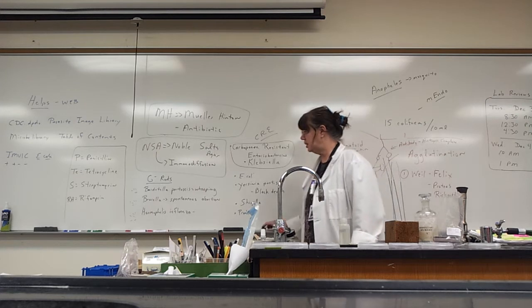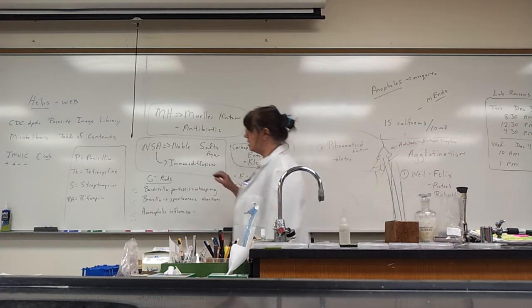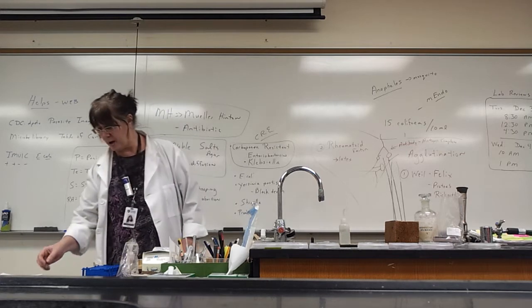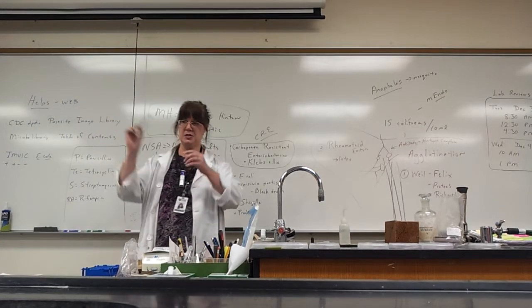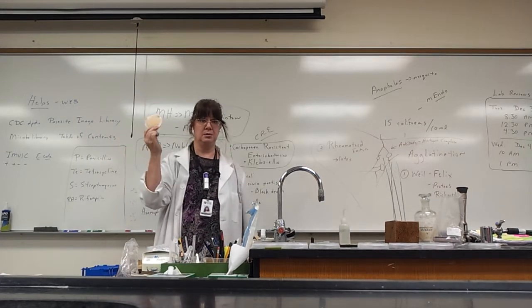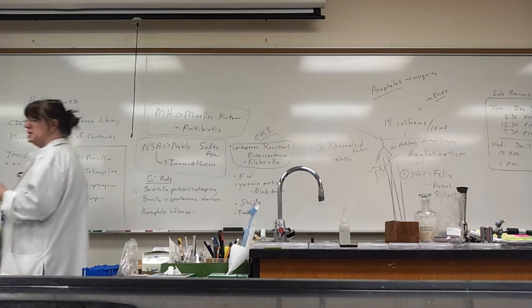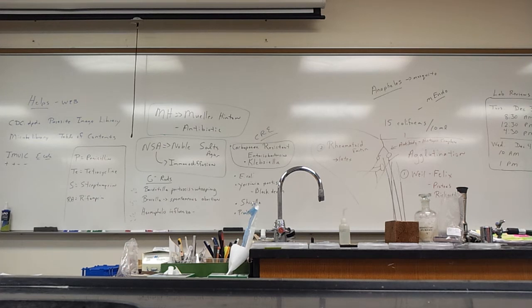Just these. Okay. Remember also, just one thing, when you did your Kirby-Bauer test, the Kirby-Bauer test was done on Mueller-Hinton agar. Mueller-Hinton agar. You're going to hunt for zones of inhibition. Zones of inhibition. You measure the zone through what? Millimeters, about the width of a toothpick. Not the width of your finger, the width of a toothpick.